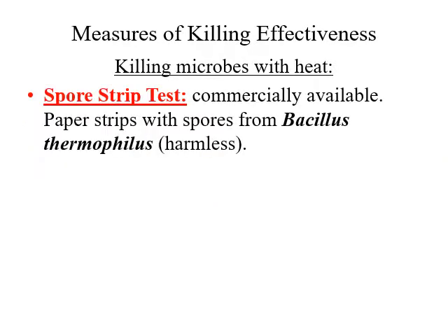All right, now how do you measure? We've discussed these methods that we're using to kill the microbes. What specifically, if you're trying to measure the effectiveness of an autoclave, for instance, let's say that you have an autoclave and you suspect that it's not working properly, you want to make sure that your autoclave is actually killing everything in there. And so there is a specific bacteria that you would use to test whether your autoclave is working or not.